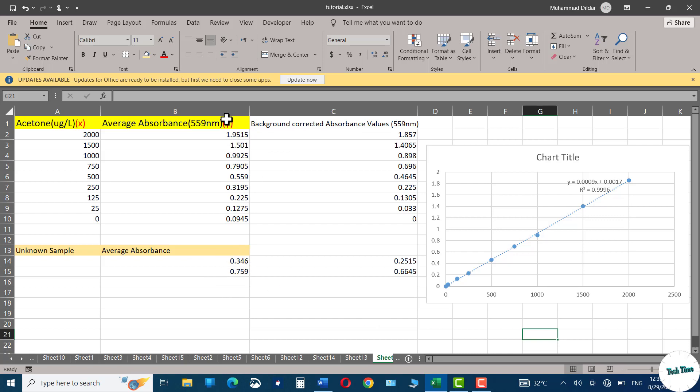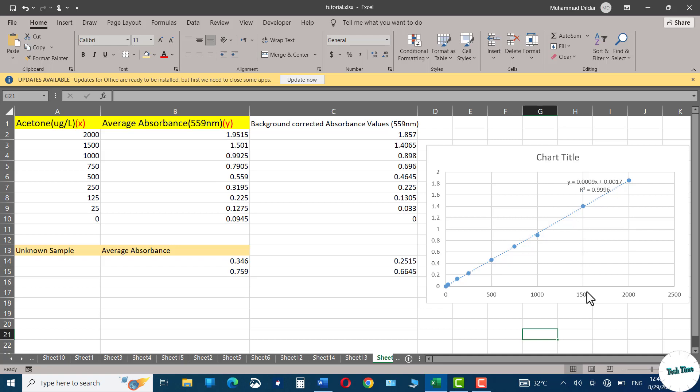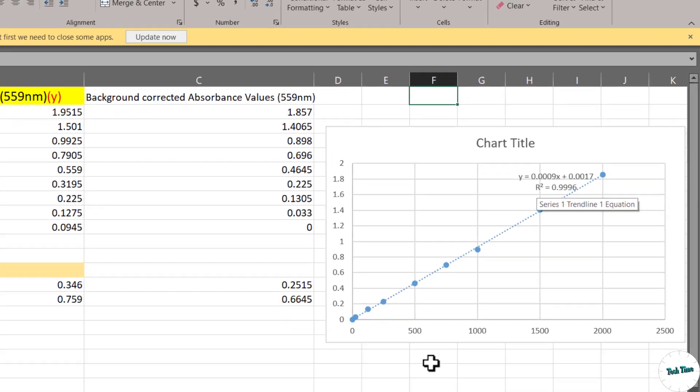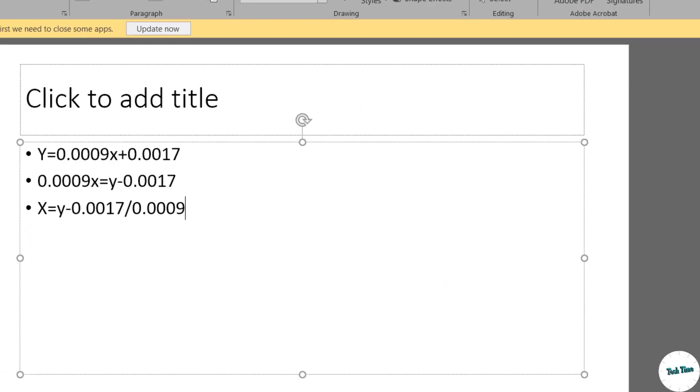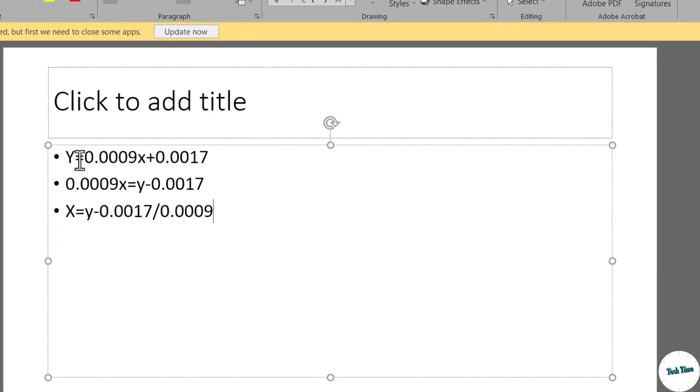Since the values given over here are y values and we already know the intercept value and we have also calculated the slope of the line as well, in order to find the amount of acetone in unknown samples we will rearrange this particular equation like this. You can see our equation looks like this: y equals 0.0009x plus 0.0017.